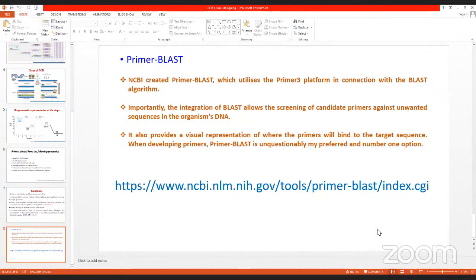Now I will show how you can design primers using Primer-BLAST. I'm leaving this screen and going online.